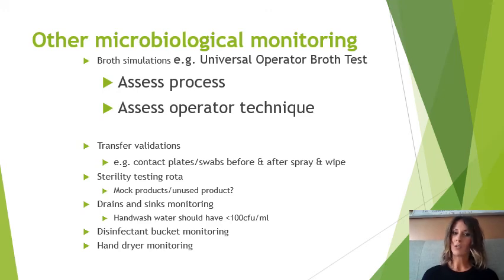So unused product would be preferential, but again, the nature of the product, would it promote the growth of any organisms? Would it be meaningful data? So you need to consider that when you're building your sterility testing regime.